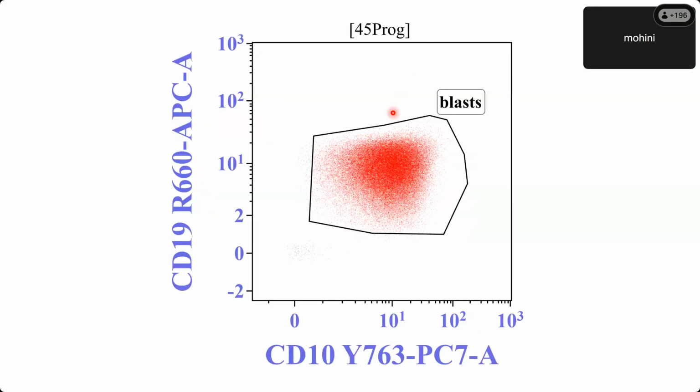Okay. So next, can Jayati take this up? This is CD19 and CD10. So this is CD10 positive and CD19 positive. Yeah. 19 and 10 are for lymphocytes, hematogones specifically, most commonly. And 19 is also a lymphocyte marker, especially B cell. So 19 is a B cell marker. 10 comes in lymphocytes. It comes in normal granulocytes also.